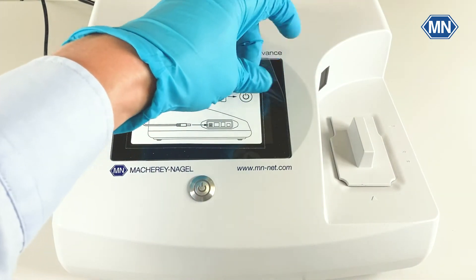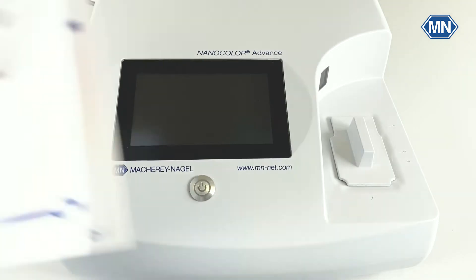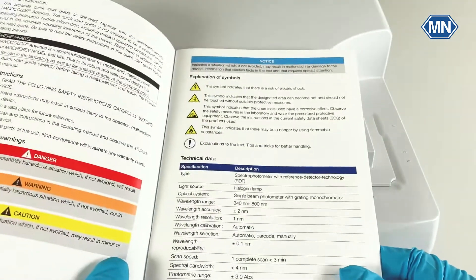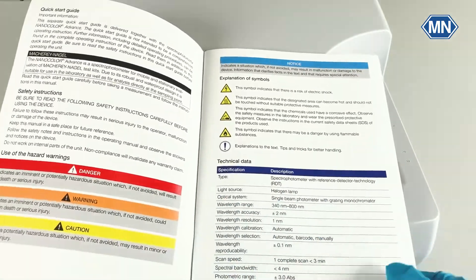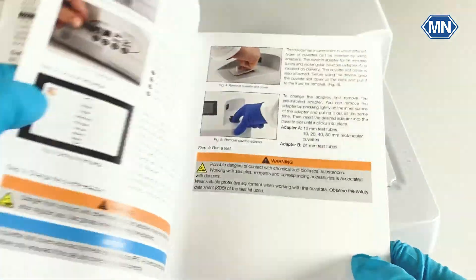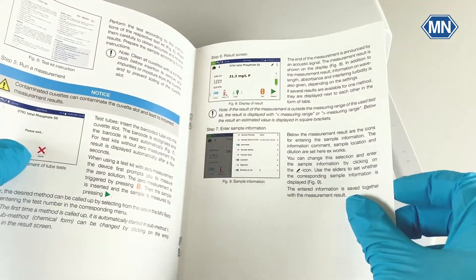If you have done so, you can remove the sticker and wait for the device to charge. In the meantime, you can take a look at the quick start guide, which comes in 10 supported languages and contains the safety instructions as well as the first steps that you can do to get reliable measurement results.